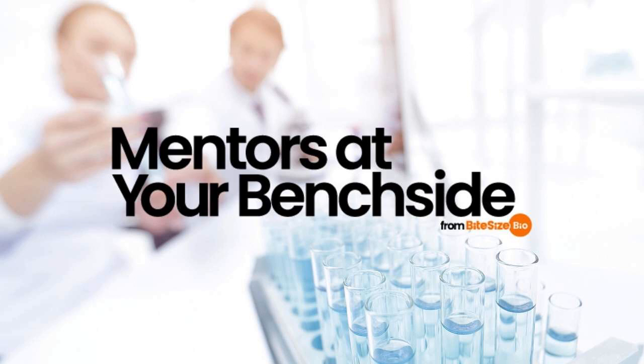I'm Jason Rogers, and today I'll be talking to you about what Maxam Gilbert sequencing is and what it's used for. DNA sequencing is a fundamental technique in modern molecular biology that has revolutionized the study of genes, their functions, and their interactions. It has helped to uncover the genetic basis of diseases, discover new drugs and therapies, monitor people's response to these treatments, and shed light on the evolution of life on Earth.